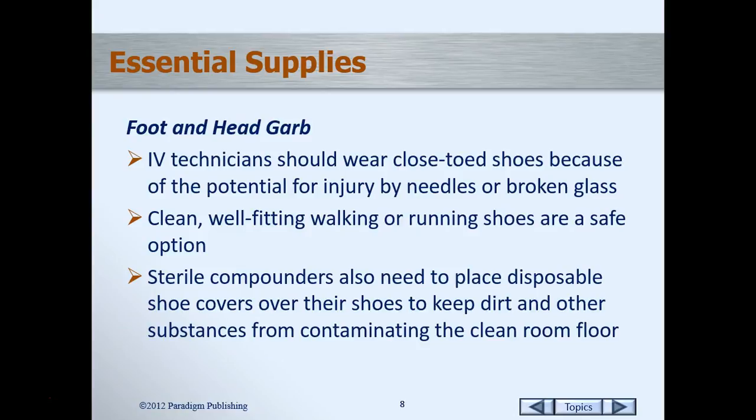Something that's going to have good support, because when you're making IVs, you usually stand for an extended period of time in one place. So you've got to make sure that you have the right support in your shoes. Also, sterile compounders need to place disposable shoe covers over their shoes to keep the dirt and other substance from contaminating the clean room floor. In some facilities, you actually cannot wear your shoes outside of the ante-room area. You have to change your shoes coming and going and carry your shoes that you would wear for work.